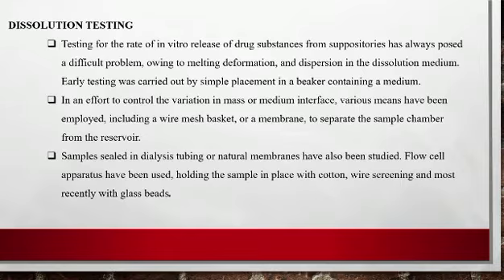Next test is dissolution testing. In this, the suppository is placed in a dissolution medium which is maintained at our body temperature, and here the amount of drug which is released over time is measured.